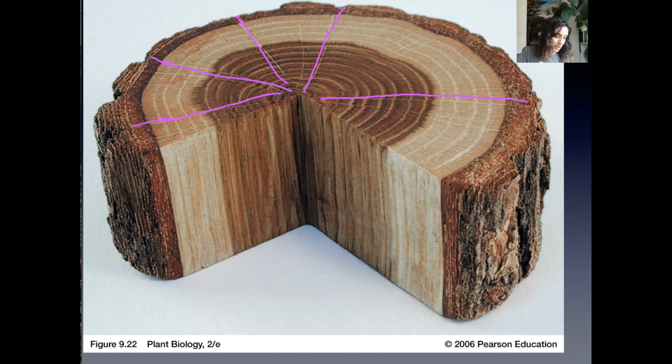We could also potentially see some of those rays in the side here. It's a little bit harder to see. They may not continue all the way down. Maybe they're just strips of these rays, stacked on top of one another. Maybe there'd be another one right here or something. Cool, these are all rays. They're really moving water around the width of the stem at this stage.